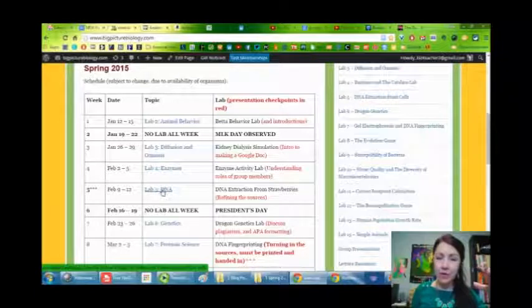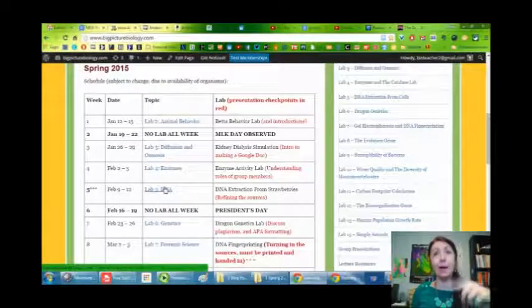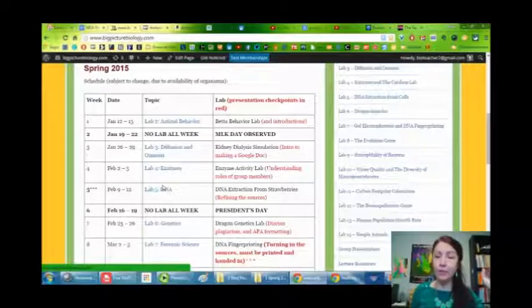So the 2 labs are the lab we would be doing this week and the lab we're doing next week. The lab that we would have done this week is Lab 4 on enzymes and catalase, which I'm going to go through with you here. And Lab 5 would be DNA extraction from strawberries.